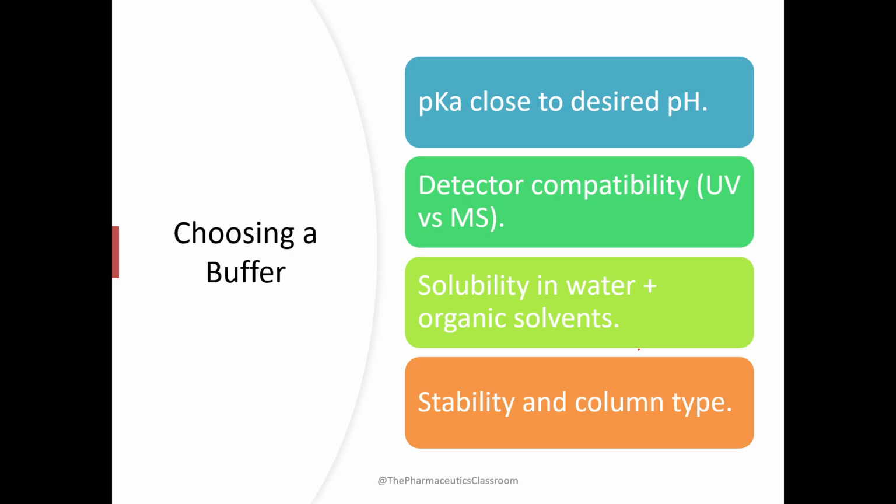Another thing is solubility in water and organic solvent. The problem with phosphate buffer is that it has very low solubility in acetonitrile.